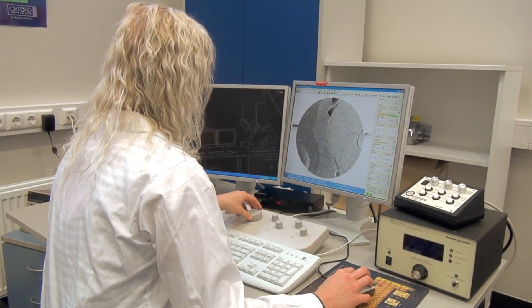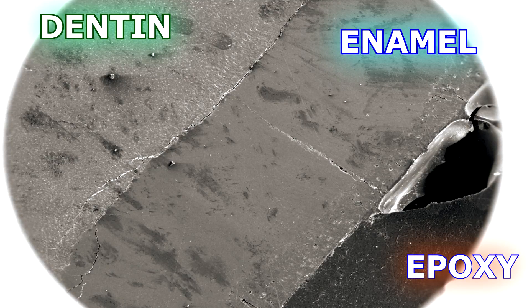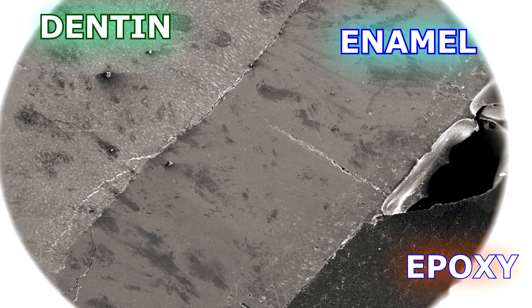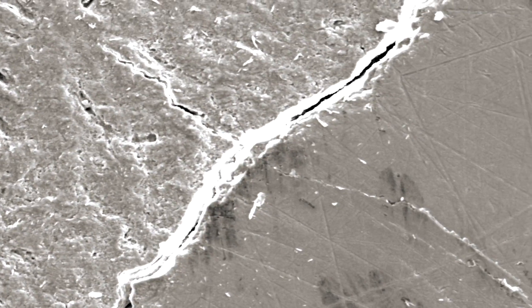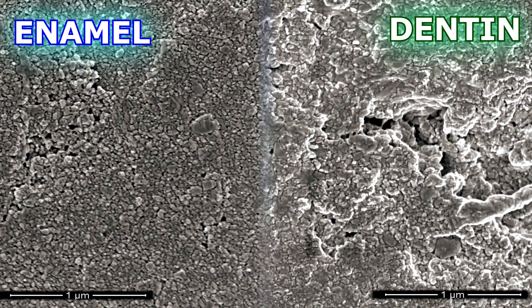All the preparations have been made and we can start our studies. The first line of defense on a tooth is the enamel. Let us examine its condition. As can be seen from the image, we can clearly distinguish the dentin, enamel and the surrounding epoxy. Furthermore, the tooth is filled with cracks. Some of them may have been introduced during the sample preparation process, but some may have been there already before.